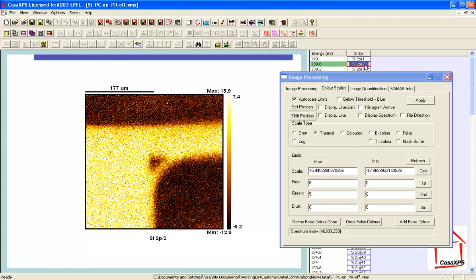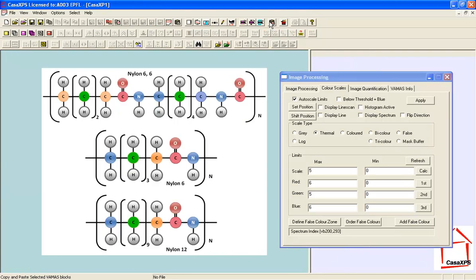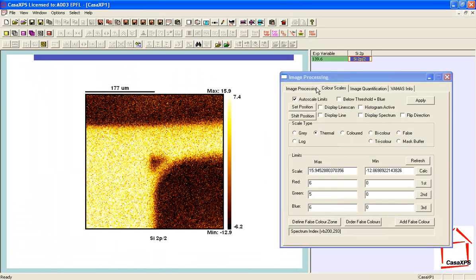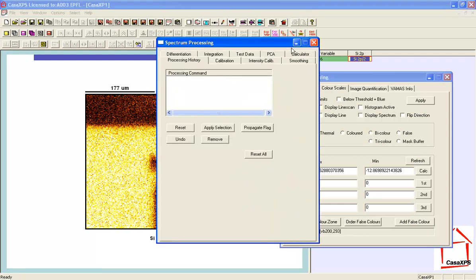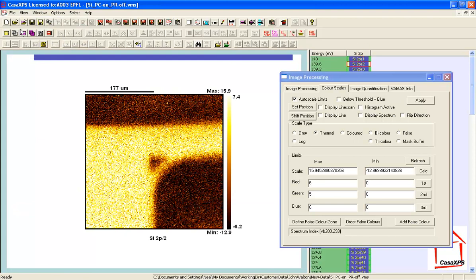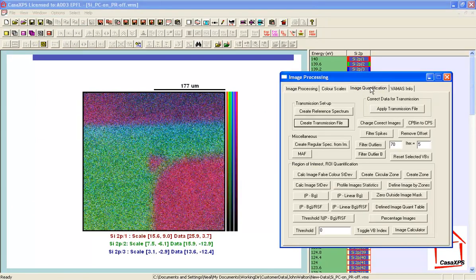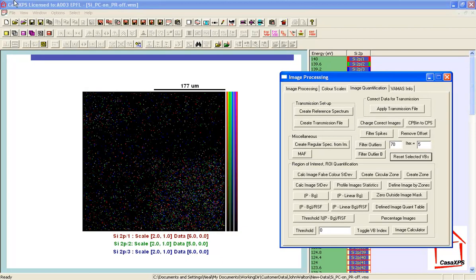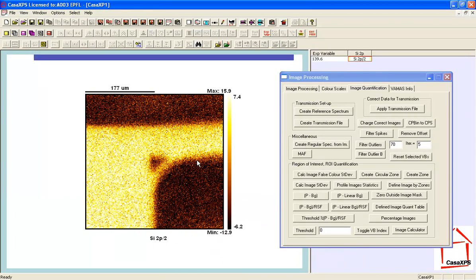In order not to lose this abstract factor when I reset the data, I'm going to copy the process data into a new file. I'll leave the original file as it is and take a copy of this process data, so there's no processing history in the copy. I can then go back to the original file and reset the process data back to the original using the reset option on the image quantification property page, which resets all data back to the original state.